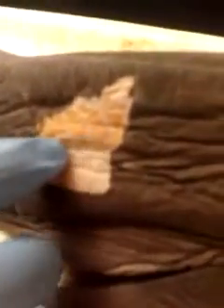Okay. This orange part here is the myomeres, and the origin is the vertebral column, and the insertion is the integument. Next, we have the horizontal septum, which is this line right here. Next, you have the myoseptum, which is a white line in between the myomeres.